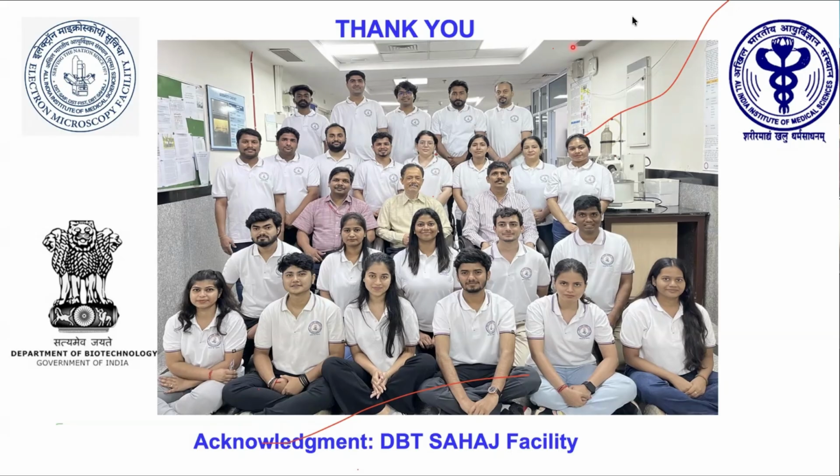The data on the yeast looks promising, right? Yeast data, yes. If you have blocks, you can just submit the same block. Suppose you have taken some blocks at room temperature. First, go with the room temperature slice and view and see whether you are getting your answer. If you are getting your answer, then you can go with the cryo conditions, and that is better. I am suggesting to everybody that if you have room temperature blocks ready with us, we use the same block. We have not done any new things.